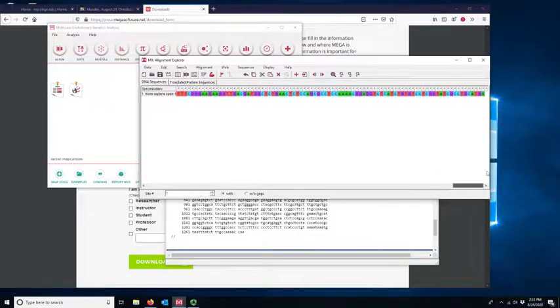This one, if you click on the end, it'll tell you, is 1,095 base pairs long. There's our stop sequence, TGA. So that is just the coding region. We've automatically sliced out all of the introns. We have only our exons from start to stop codon all spliced together. So this is what the mRNA would look like, except you'd have U in place of T. Okay, so it's really nice and handy.